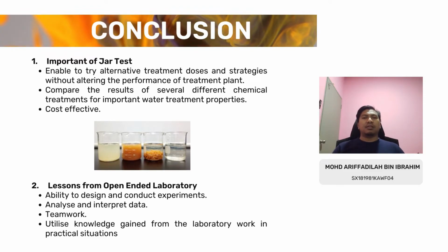The jar test is important because by performing it, we can try alternative treatment doses and strategies without altering the performance of the full-scale treatment plant, and easily compare the results of several different chemical treatments for the time of formation, floc size, settleability, and perhaps filtration characteristics.